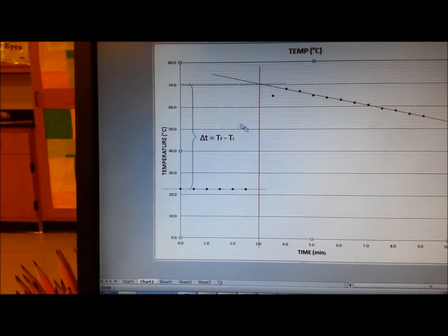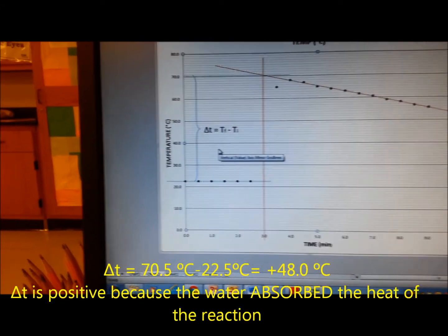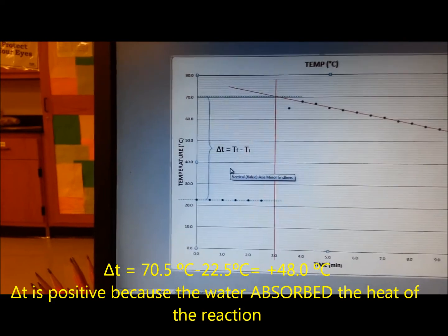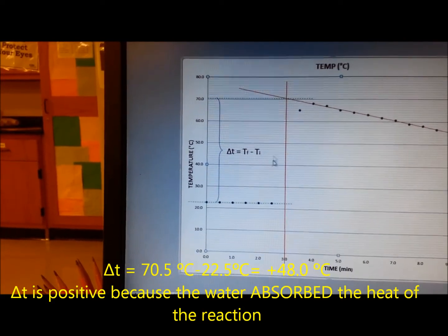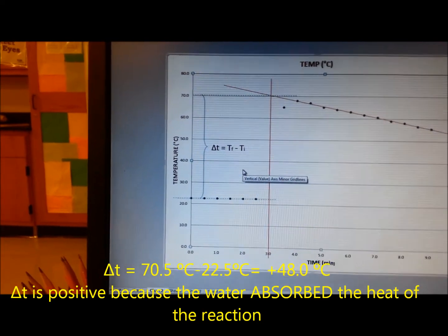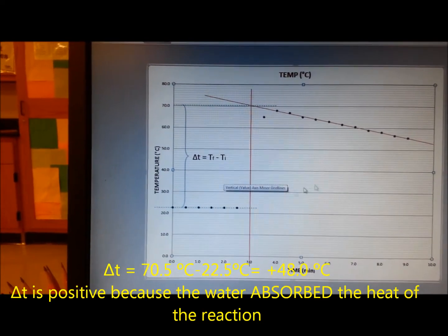The temperature increase in this case that the solution of the copper sulfate is going to be experiencing. In this case, that is the temperature change in the water, and with that delta T, we can calculate the amount of heat released.